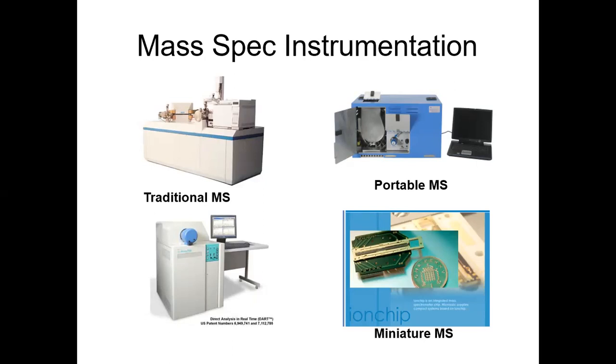So if those explosives are there and you run a mass spec, you'll be able to pick up certain fingerprints. They have databases that have all of these fragments stored. So if it's a specific compound, even if it's not that exact compound, if it matches, you're probably going to end up being detained and questioned, at least at the minimum. But these things started showing up in airports. They don't do it as much anymore. But after 9/11, that was a big deal. And every airport had, once they formed TSA, the TSA didn't always exist, but once they formed it, they had these portable mass specs right there by the little X-ray belt where they scan your bags and all that stuff.